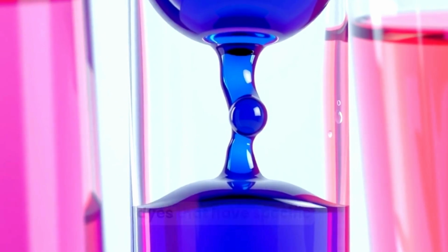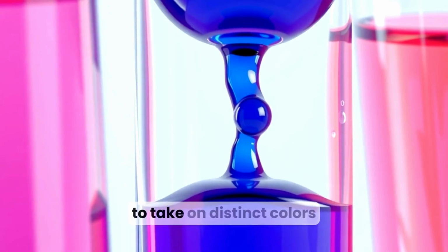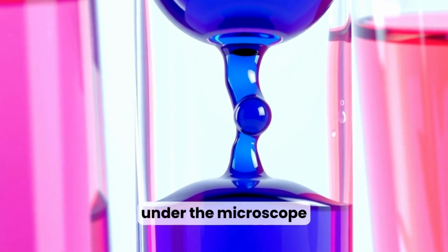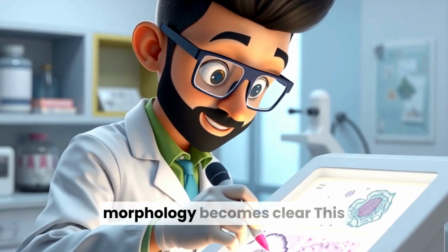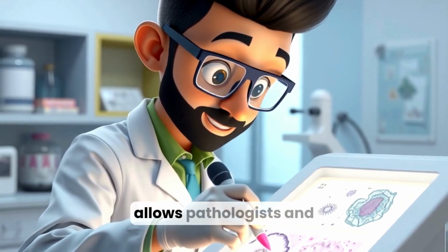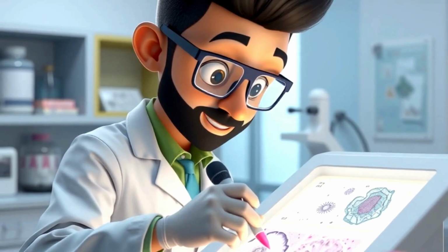Staining involves applying dyes that have specific affinities for different tissue components, causing them to take on distinct colors under the microscope. When dyes bind selectively, contrast increases and morphology becomes clear. This allows pathologists and researchers to read tissue architecture like a map.